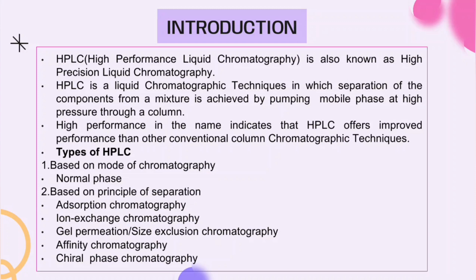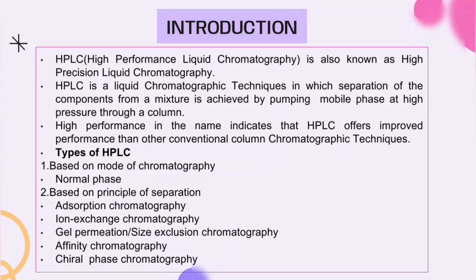Then coming to the types of HPLC, based on mode of chromatography and based on principle of separation. Based on mode of chromatography, there is normal phase HPLC. It is a type of partition chromatography where the stationary phase is polar and the mobile phase is non-polar.